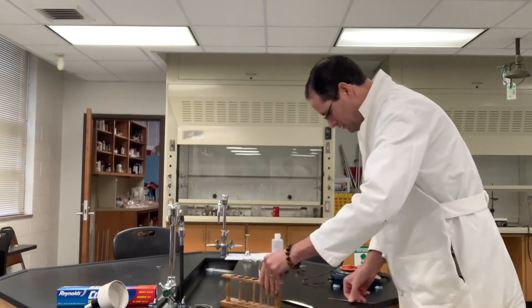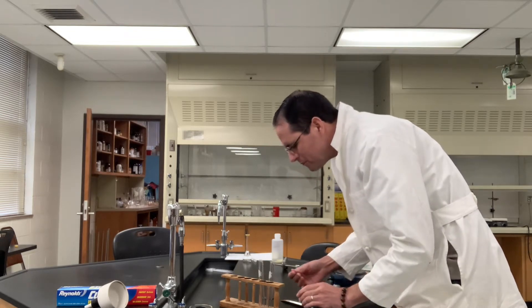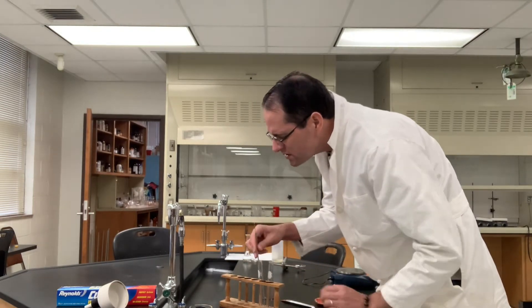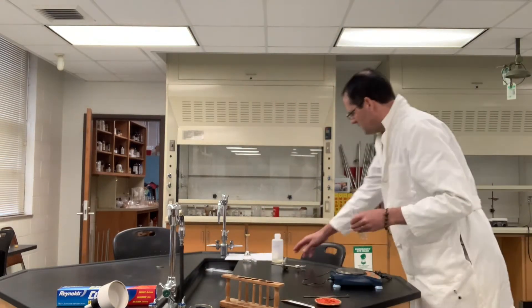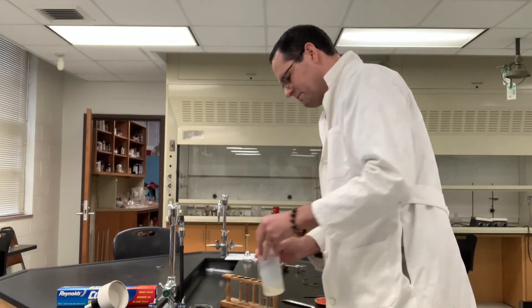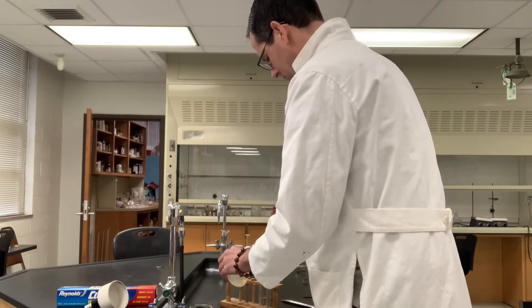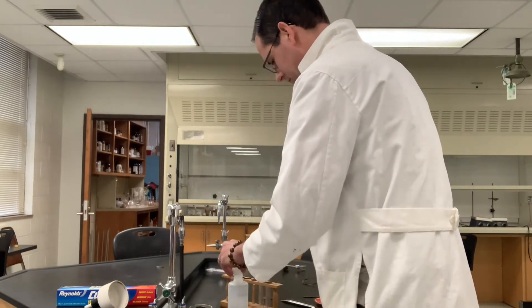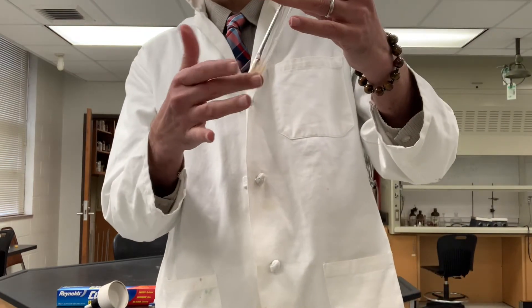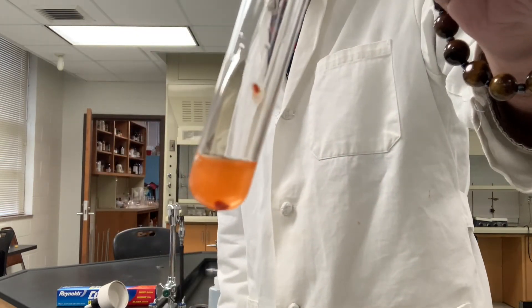I've got two test tubes here with a small amount of our methyl orange acid-base indicator in each one. First, we'll react the methyl orange with some sodium hydroxide. That's the sodium hydroxide there.